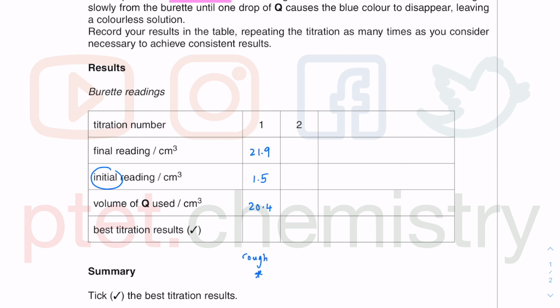I make it a habit of always doing a rough titration because if I start wasting my time doing drop by drop from the very first one, then I will never really know around what volume I should slow down and start doing drop by drop, because I don't even know where the exact titre is if I don't do a rough titre. I know I shouldn't take the reading for the rough titre at all because it's meant to be in excess. I wasn't being careful. I did not do it drop by drop, and therefore it can never be an exact titre.